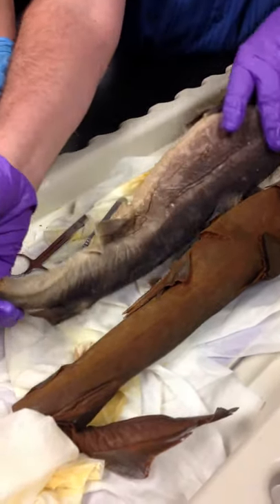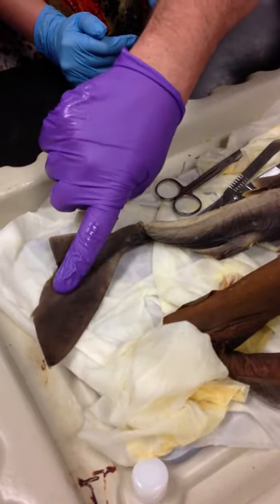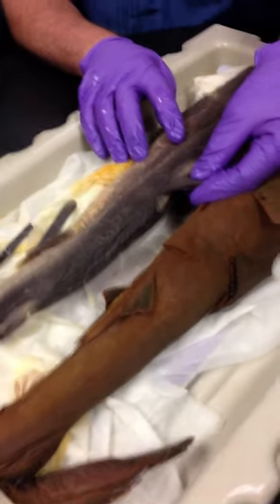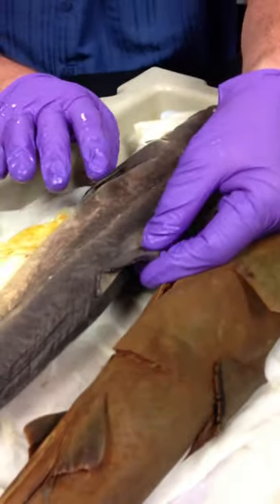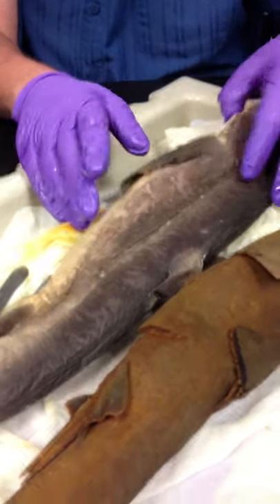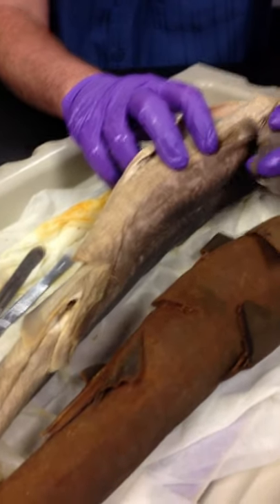Why do they cut the tail like that? So it fits in the bag better. Look at this tail. It's got a caudal fin. You see this? What's that called? It is a heterocercal tail. Very nice. And then we have a dorsal fin. Now, I'm going to tell you a secret about dorsal fins. I know a lot about shark anatomy. Dorsal fins are known to change the color of water to red. Because you see a dorsal fin and all of a sudden the water is red and you're like, what happened here? And here are our pelvic fins again, and there are our pectoral fins again.